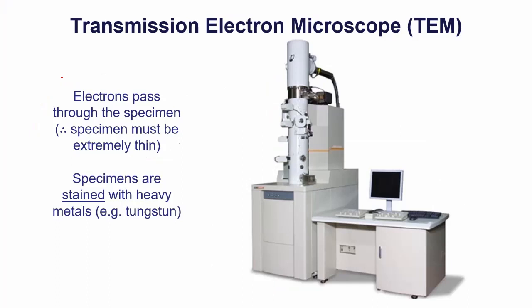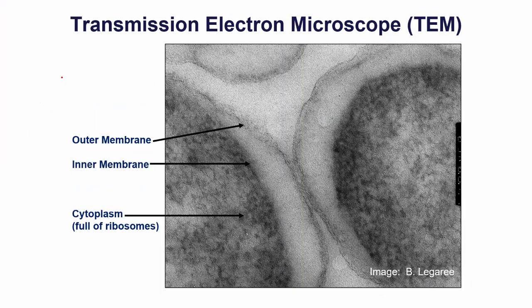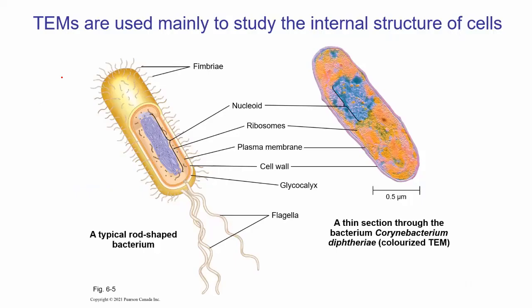You can see the electron guns are often a little bit bigger, and these are even more expensive microscopes. So we're talking about $250,000 plus, unless you get one used. I suppose maybe you could find them on eBay. I don't know. So I did some transmission electron microscopy. It took about 2 weeks of my life to get this image. It's not very good, so I kind of moved on. But you can see it's a different kind of image. You're seeing inside the cell with transmission electron microscopy. I'll show you some better images.